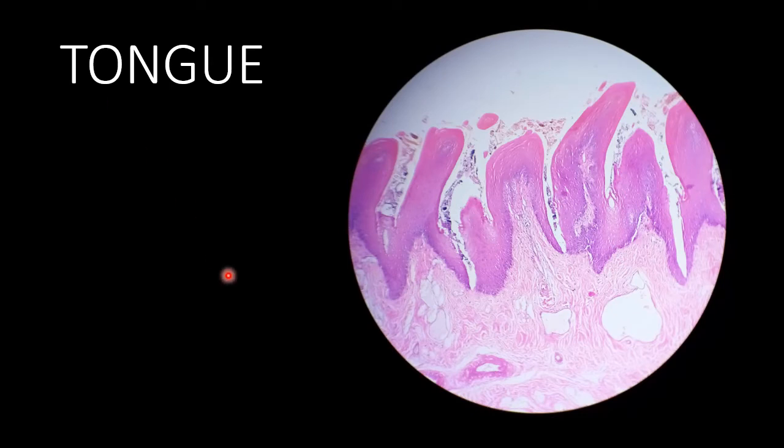So the first system which I am going to discuss is the gastrointestinal tract. The first slide which we are going to see is the tongue. How to identify the tongue? In the tongue we can identify the papillae. There are two types: circumvallate papillae, and fungiform and filiform papillae. But I'm not showing the circumvallate papillae, rather I'm showing the filiform and fungiform papillae. How to identify them: it is lined by stratified squamous non-keratinized epithelium, and the surface shows projections. These projections are called papillae.